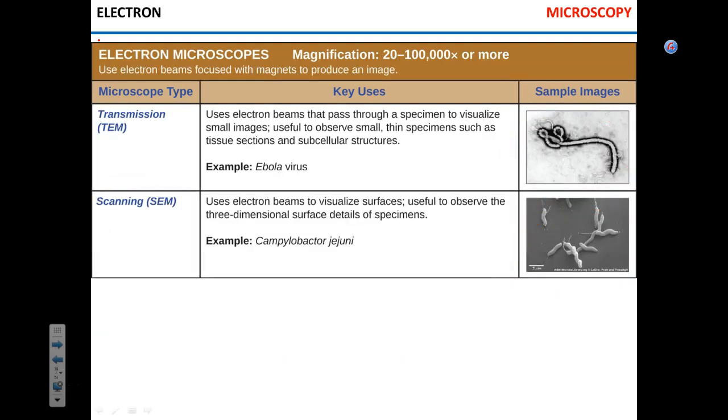Now, those are 7 types of light microscopy. Any questions? I believe the question that you have, what would be the exemplary question in the test? Something like, this type of microscopy produces a 3D image of the cell: confocal. Does that make sense? I will make it really descriptive, really thorough, and I never had any problems with those questions. They're really clear. If you know, you know.